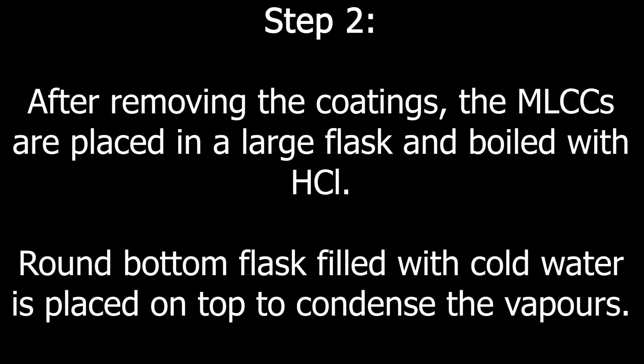Step 2. After removing the coatings, the MLCCs are placed in a large flask and boiled with hydrochloric acid. A round bottom flask filled with cold water is placed on top to condense the vapors.